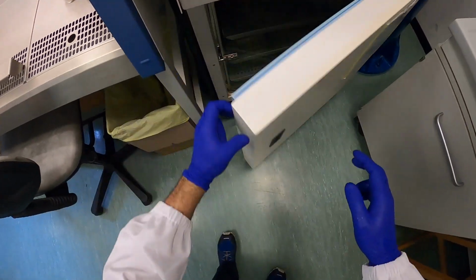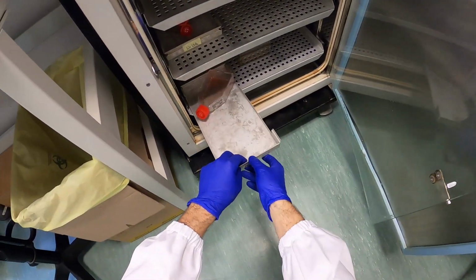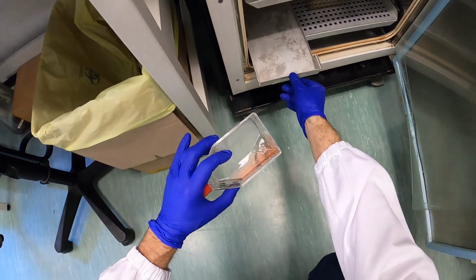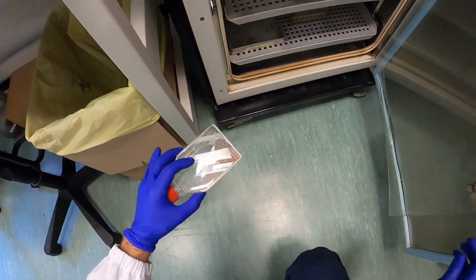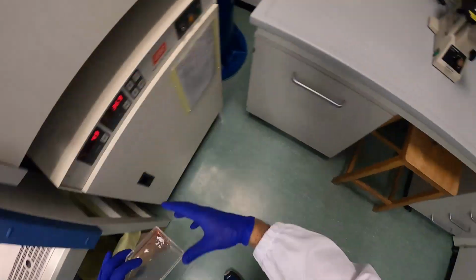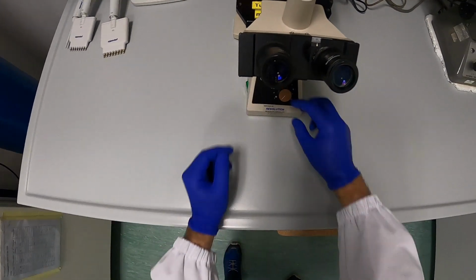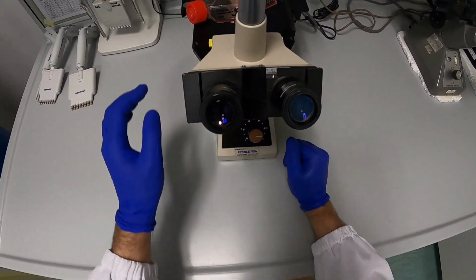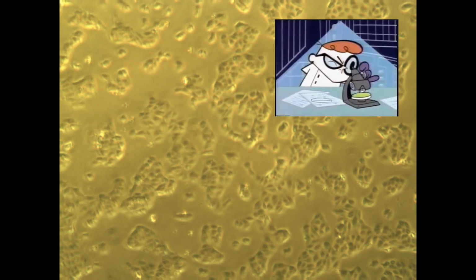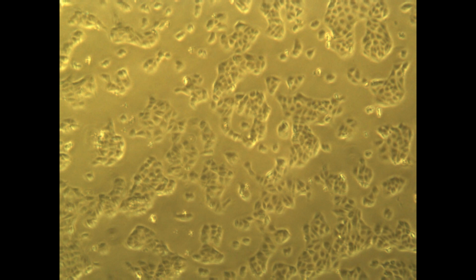And we're ready to get the cells. So we open the incubator. It's a 37-degree incubator with CO2 at 5%, and inside you find your flask. It's a T75. Let's have a look under the microscope. We switch on the microscope light and let's have a look. Okay, there are the cells. Focus a little bit, like that, perfect.